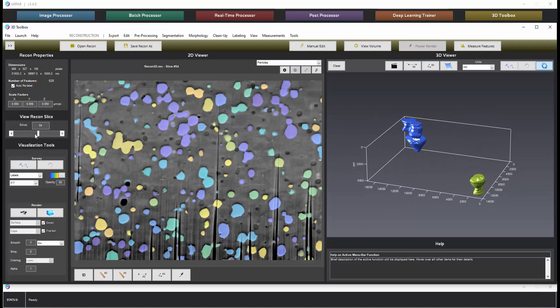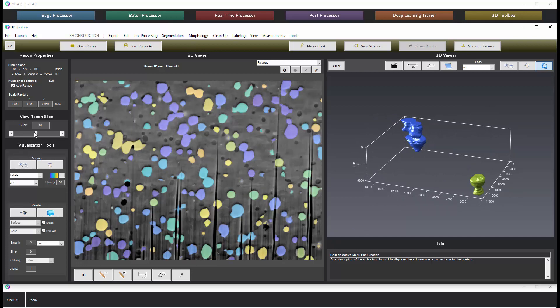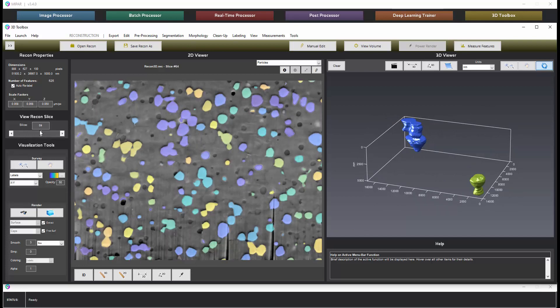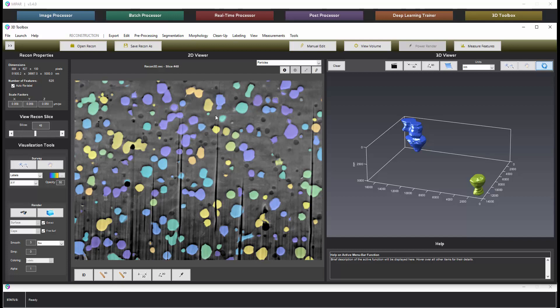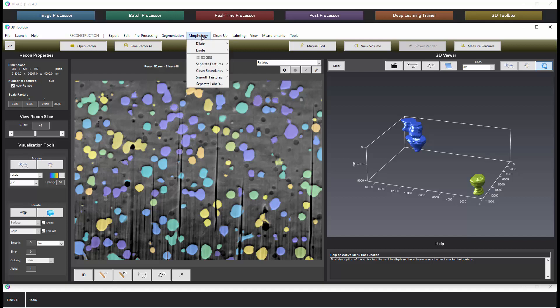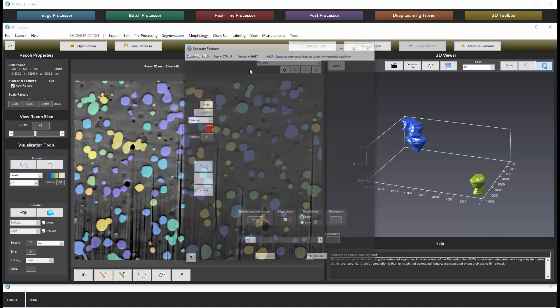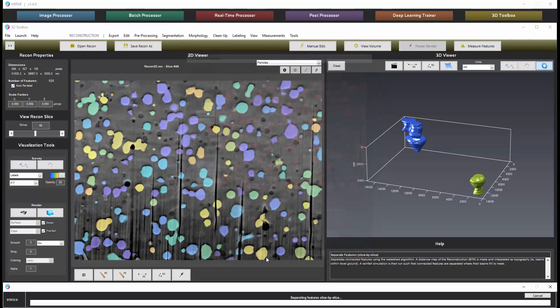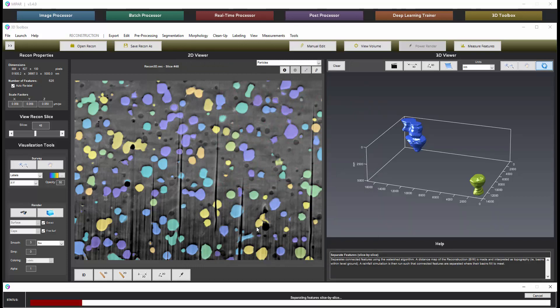If we wanted to try to separate this data set, the features in this data set, I would first try a pass in the XY direction slice by slice using separate features. Generally a value of two or three works well and this will then apply separate features to each XY slice that will begin the separation.